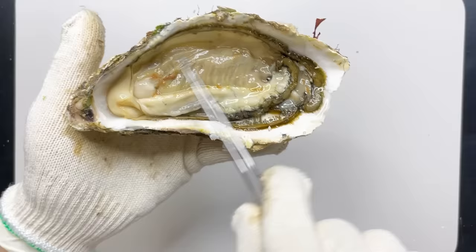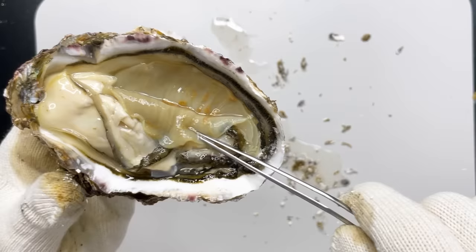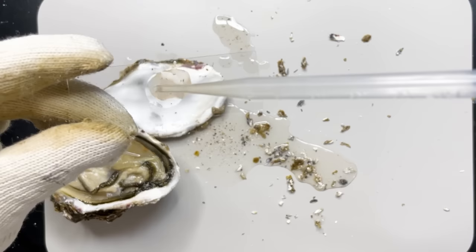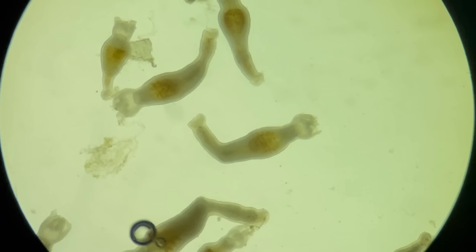The reason why gills are such a big part of oysters is that oysters use them to feed themselves. If you look at the gills here, you can see that something is being filtered out. Oysters use their gills to filter organic matter out of the water. I took these organisms with a pipet and magnified them under a microscope. It's a complete shock. I thought they were just dregs, but by looking at its shape, they're probably the larva of cnidaria, like hydra and sea anemones.